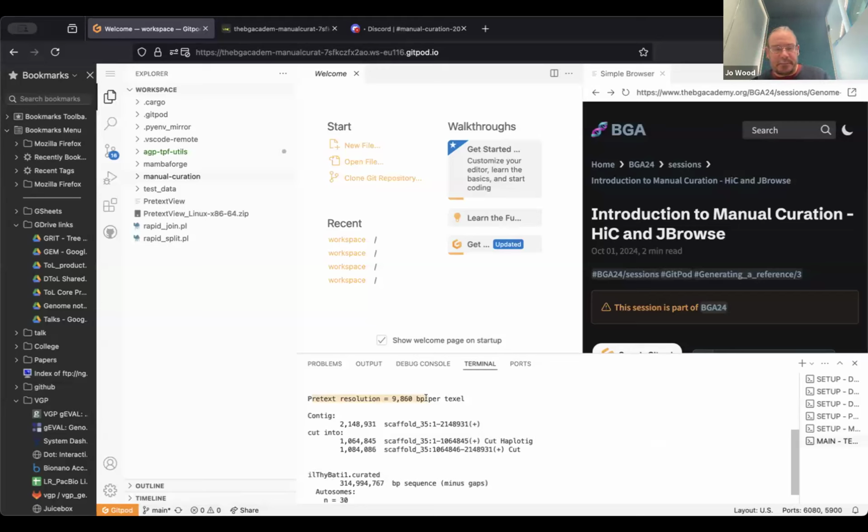I think there was a question in the pretext about how accurate placing a sequence is if we're not trying to import a sequence, but place a sequence in a gap. In this genome, this is how accurate this placement is, within plus or minus nearly 10,000 base pairs.